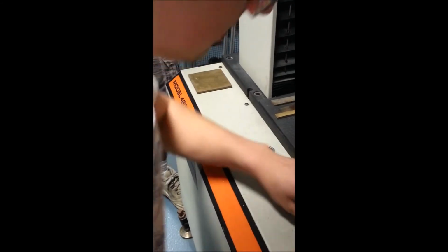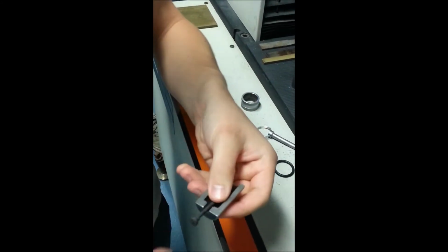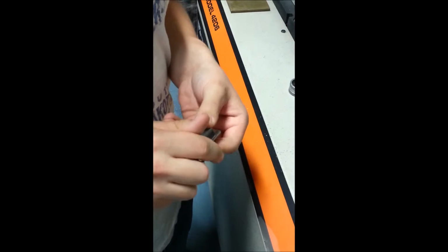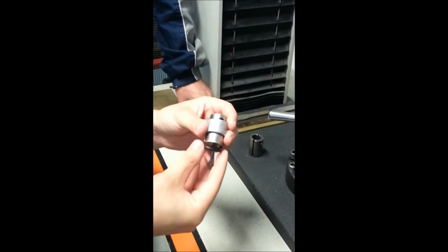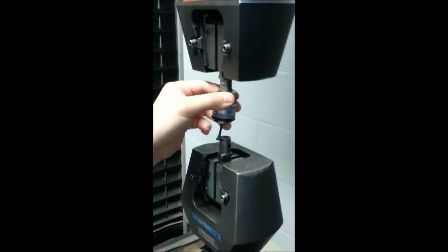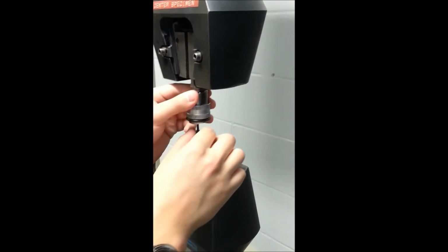After this was entered, it was time to place the sample in the machine. First, you took the sample and placed it in the bottom half of the cylinder. Then place the second half of the cylinder over top, and then take an O-ring and rubber seal around it up through the bottom. Then place it in the top half of the machine.